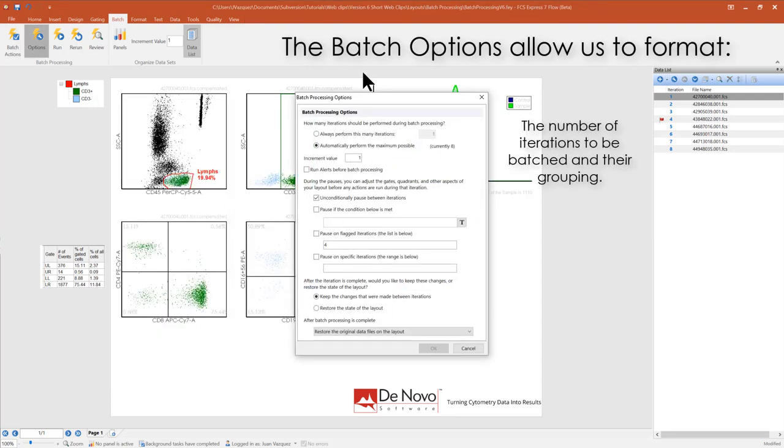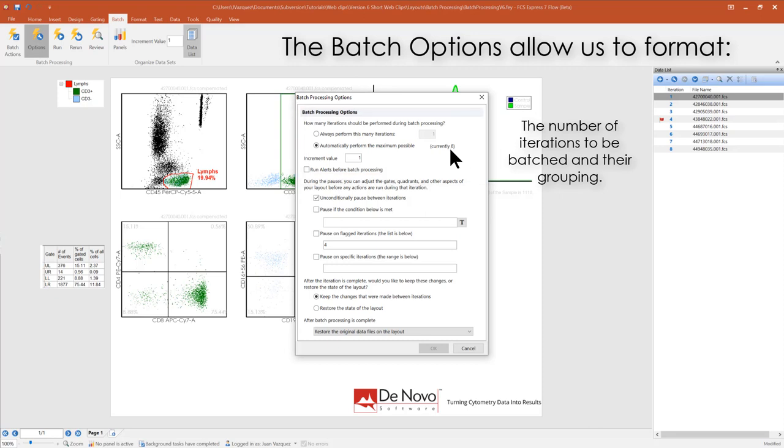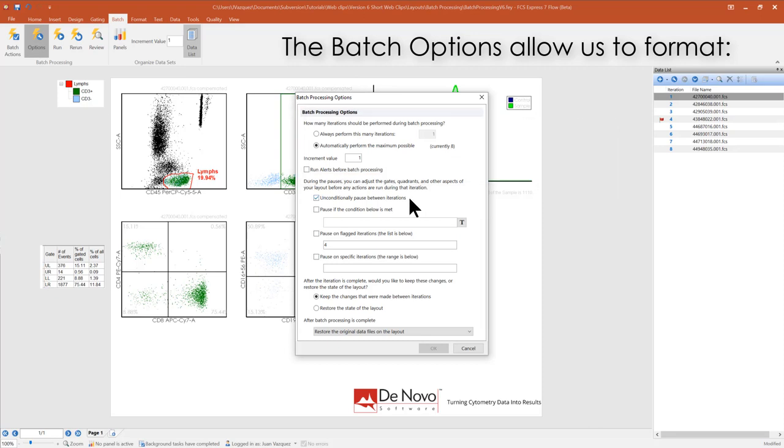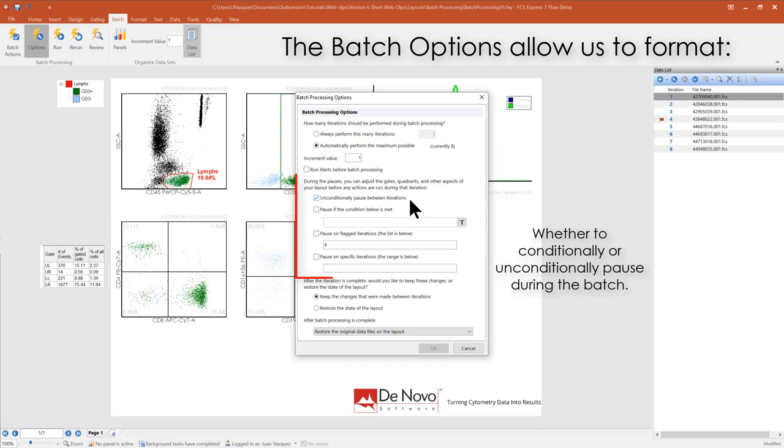Batch options allow us to format the number of iterations to be batched in their grouping, whether to conditionally or unconditionally pause during the batch.